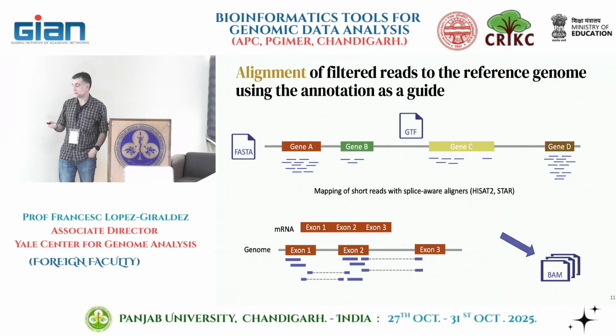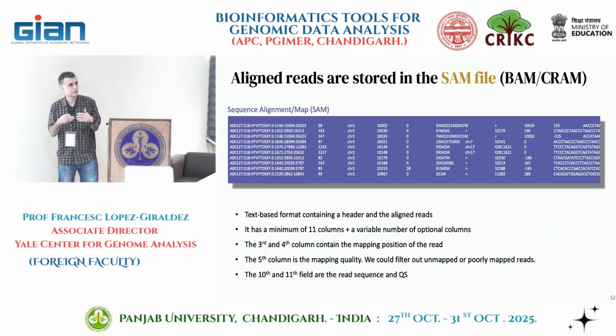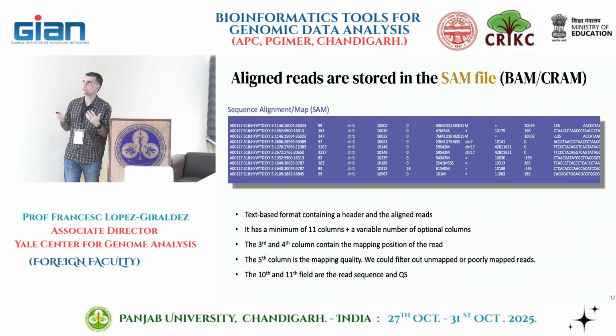Out of these, we're going to obtain the BAM files. As I mentioned at the beginning of the workshop, we'll talk about the formats. I think you need to be aware of the formats and how they look, because sometimes we visualize them minimally to know whether something is in there. This is called a SAM alignment, SAM file or BAM file, depending on whether it's compressed, or CRAM if you compress it even more. But it's the same structure inside.